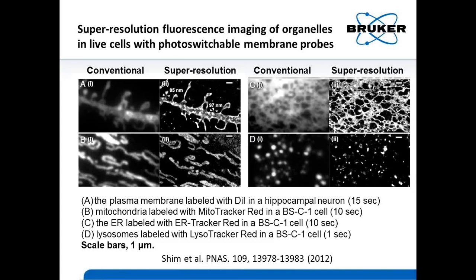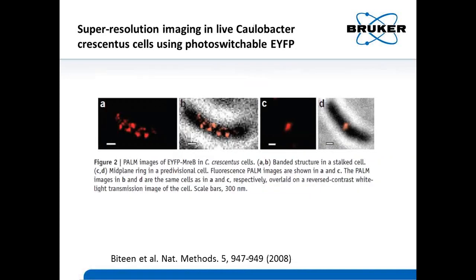The one caveat with all this is that you just want to make sure you're using the right incubation times, and you're also optimizing for low background. So whatever you can do to minimize background and up your signal will definitely make a big difference in the quality of image that you're going to get.